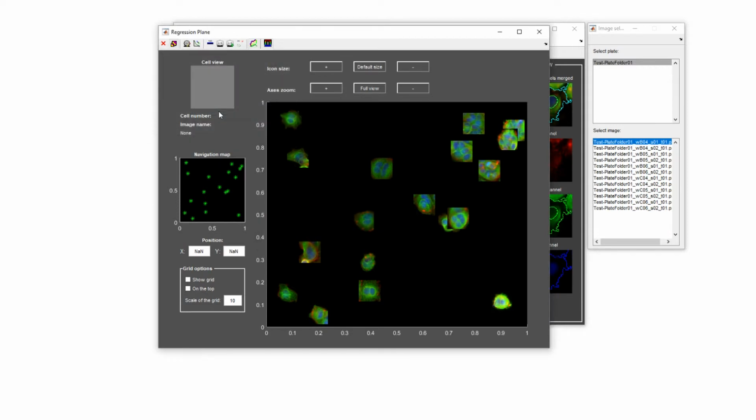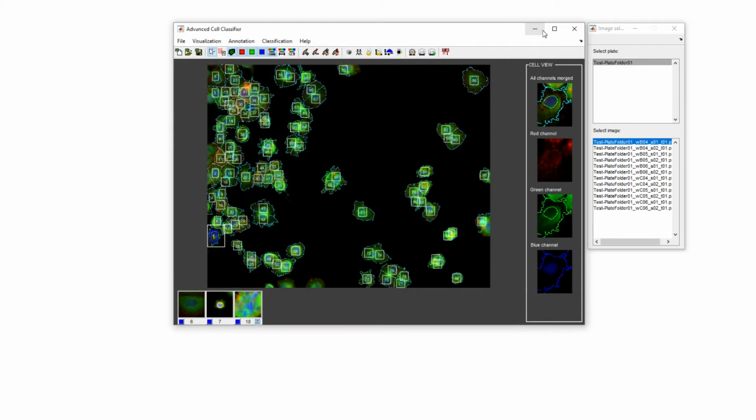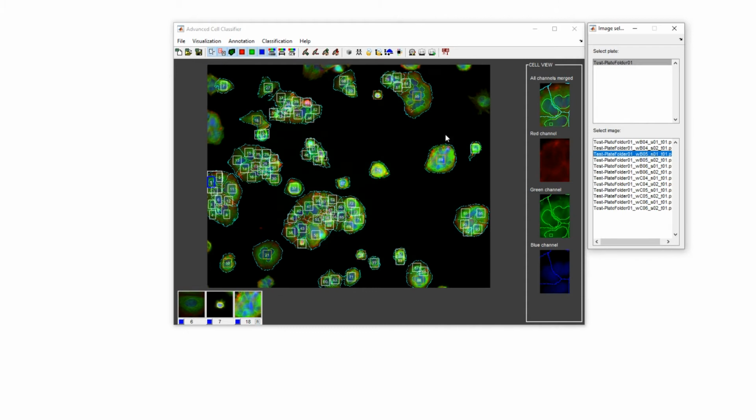The main aim of the regression plane is to predict cells in a continuous manner, without the need of fixing intermediate cell stages. This way, a biological process is considered inherently continuous. Each cell predicted by the classifier as belonging to a regression class will be also associated with a position in the regression plane by the regressor.